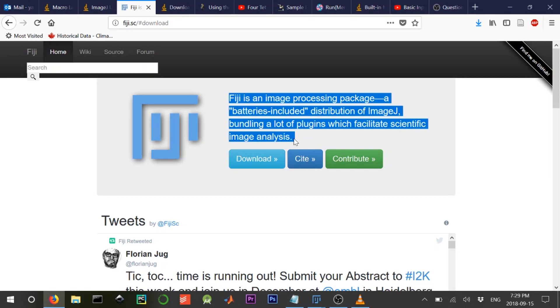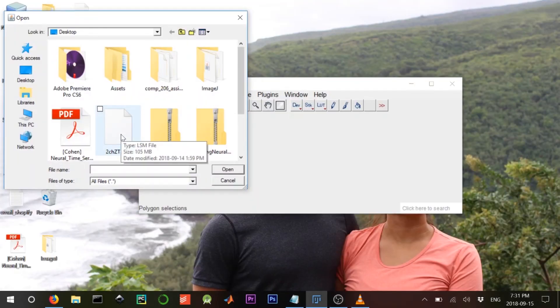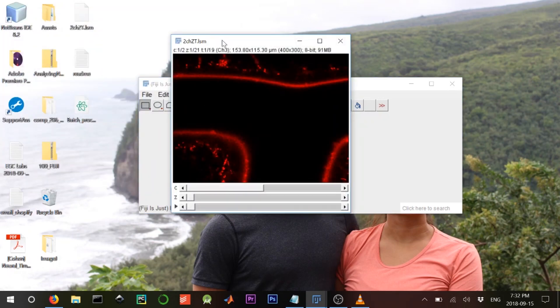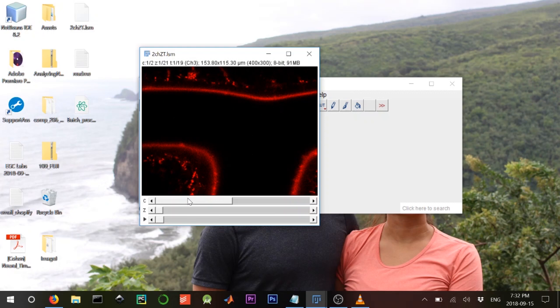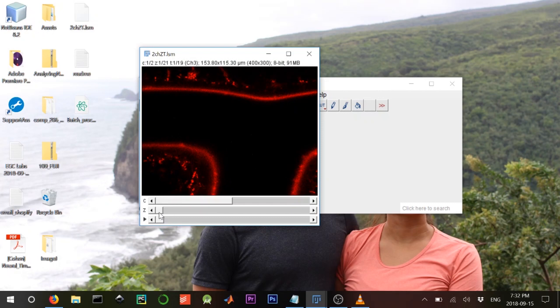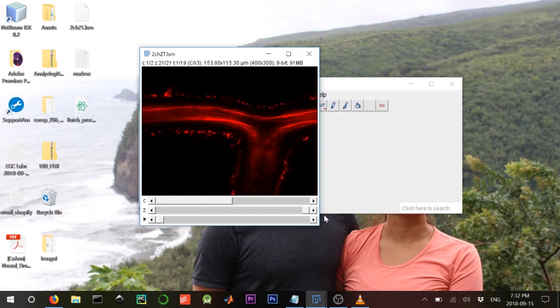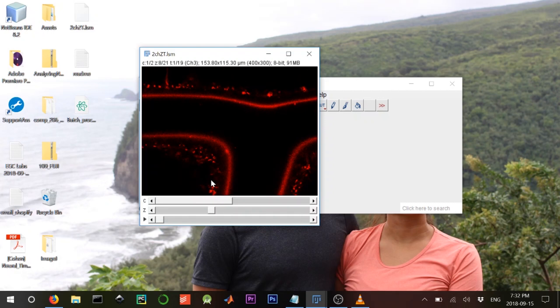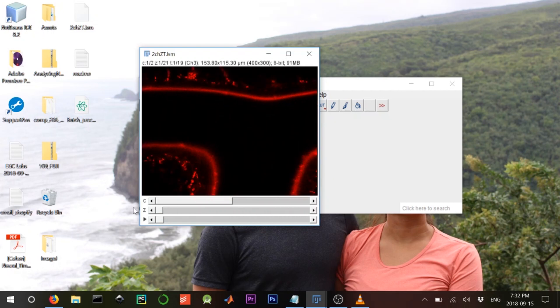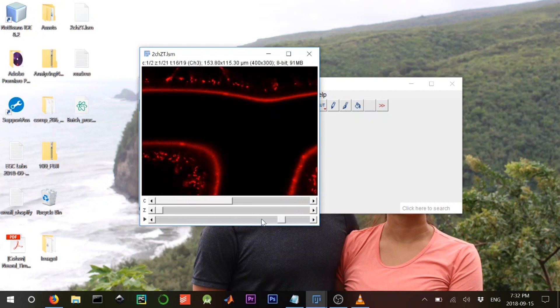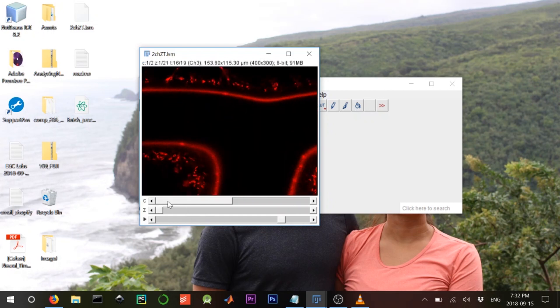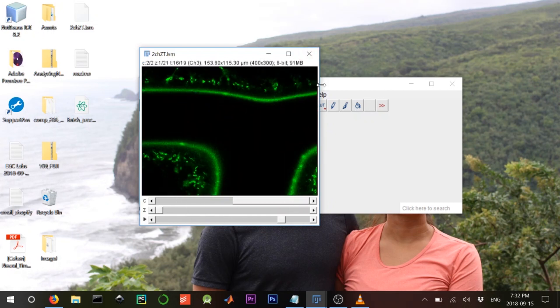Step two is making a script on ImageJ to analyze images in batch programmatically. With ImageJ you can open a file and look at it. This is the file I'm going to work with today. There are two channels — red and green — and it's a z-stack, so there's depth.